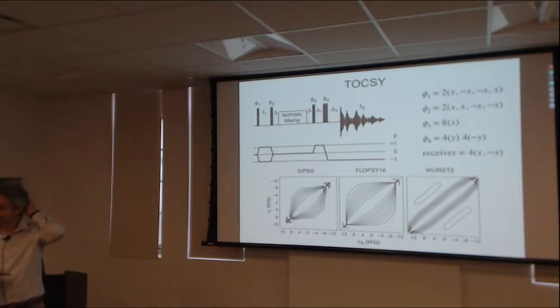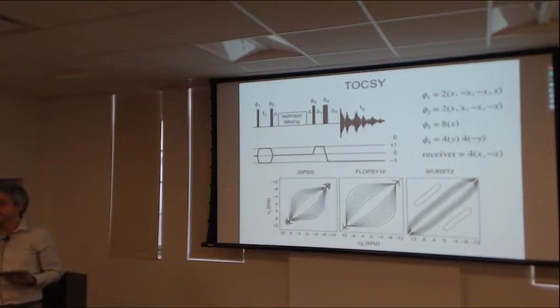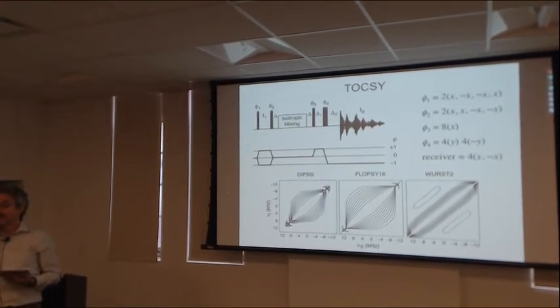Just to give an order of magnitude, for those deuterated samples versus the protonated samples, in theory they should have about a 36 times smaller relaxation rate. In practice, there are other effects from the deuteron, so you don't get quite that much, but it's really profound.